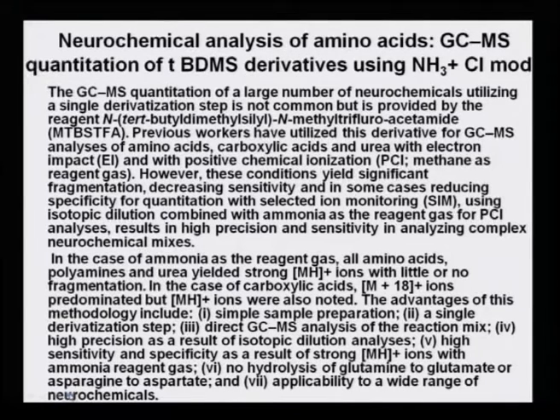Previous workers have utilized this derivative for GCMS analysis of amino acids, carboxylic acids and urea with electron impact and with positive chemical ionization using methane as the reagent gas.